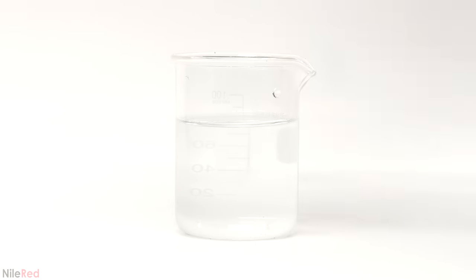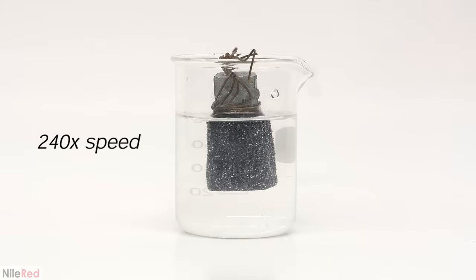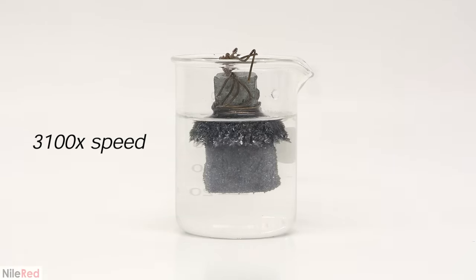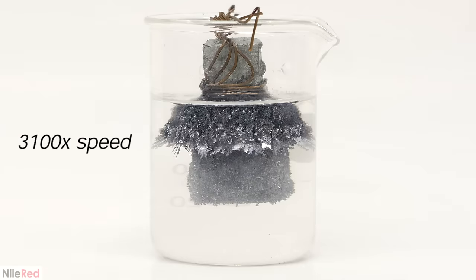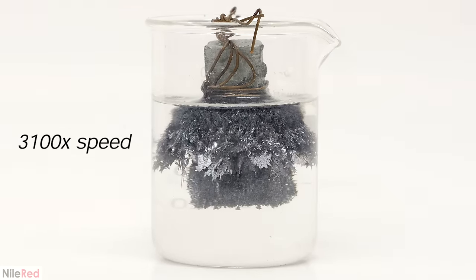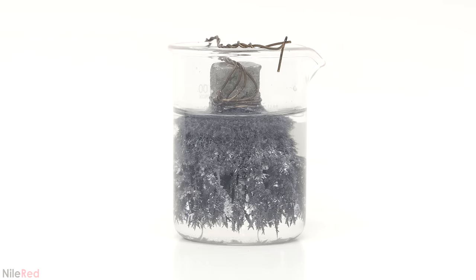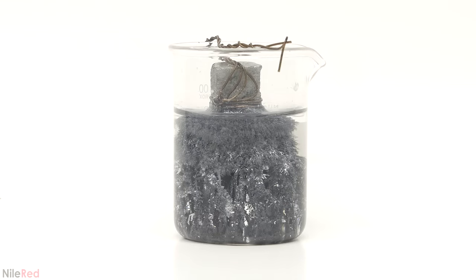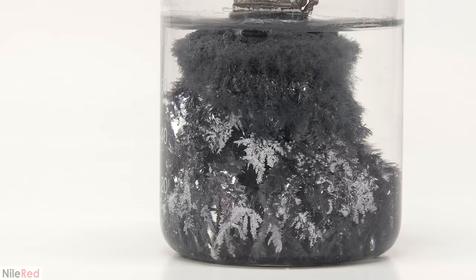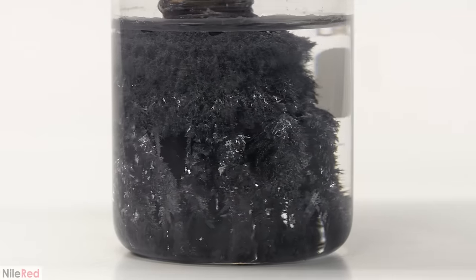I remade a lead acetate solution in the exact same way as the last time and dropped in the zinc. I took another time lapse, this time over the course of about 9 hours, and then I let it sit overnight. This is now 24 hours after I started, and this is about 32 hours. I covered the beaker with some plastic wrap, and now a week later it pretty much looks the same.